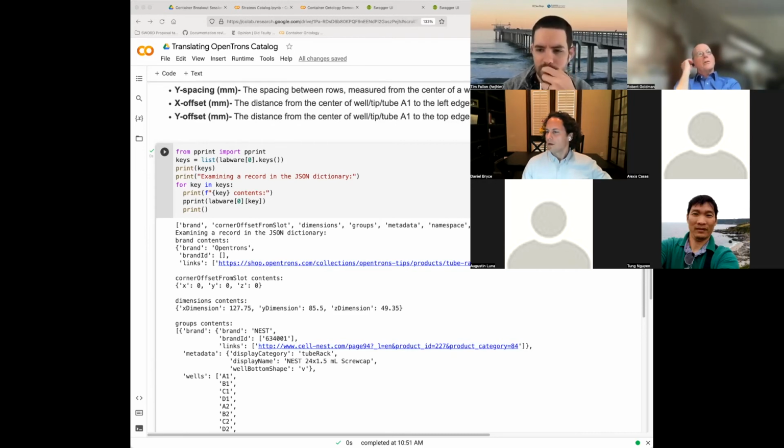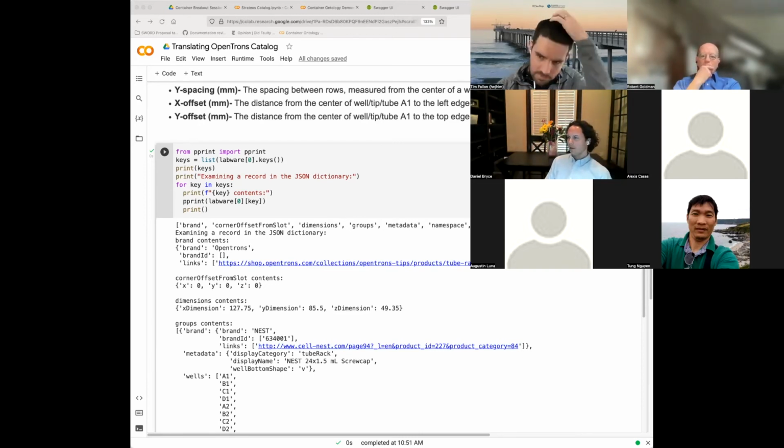Or anything you'd like me to return to explain. Well, the one thing that's on my mind is we have somebody that's writing a protocol, say it's in just a Python file. What's probably the most natural workflow for them to configure their protocol with the container ontology?